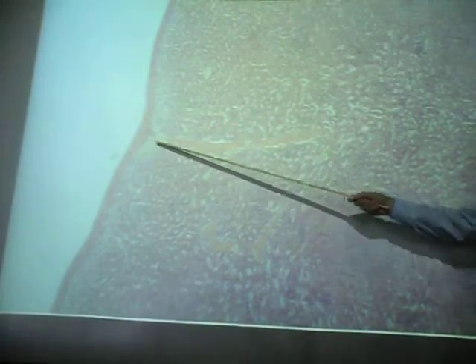And extending from that, just like we saw in the lymph node, what are these? Trabeculae again. And basically an extension of the capsule that projects into the organ and provides further support. Now the spleen has two regions. We see one right here. What is this?